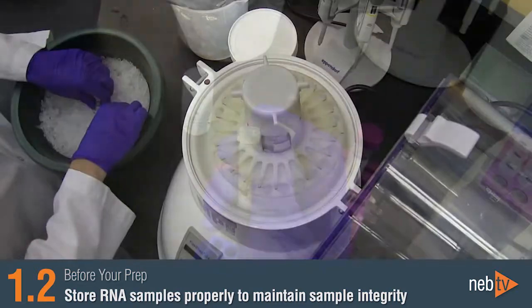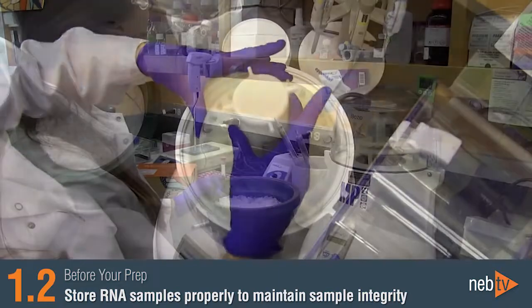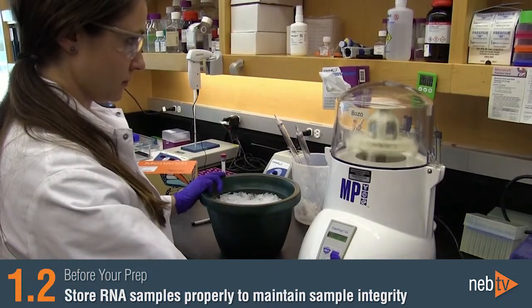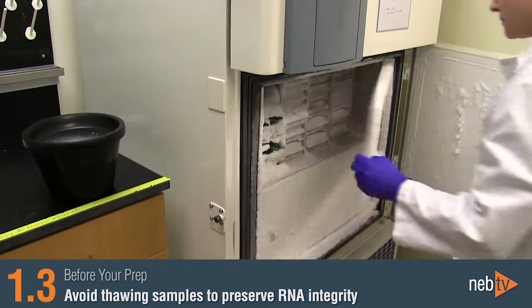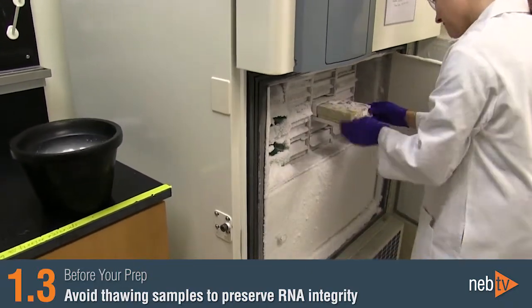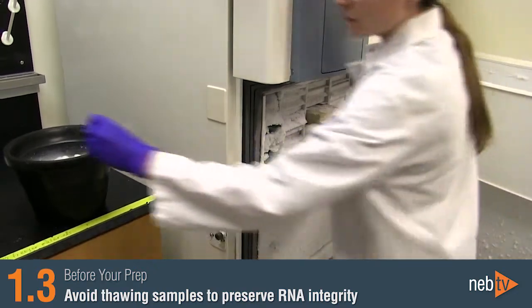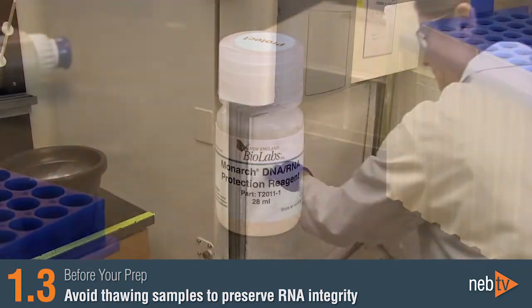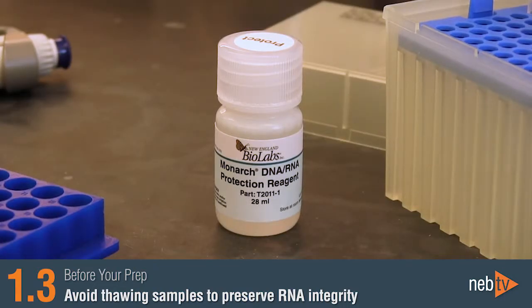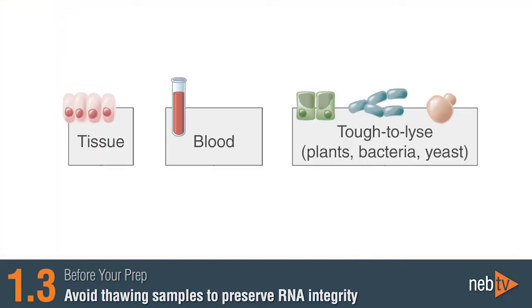If samples have been preserved in the protection reagent, do not remove the liquid prior to processing, as the protection reagent also begins the lysis of the sample. It's important to avoid thawing your sample in order to preserve its integrity before extraction of the RNA. Frozen cultured cells can be thawed briefly before the addition of the RNA lysis buffer, but most other sample types should not be thawed in the absence of the protection reagent or the lysis buffer. These samples include tissues, blood, bacteria, yeast, and plants.